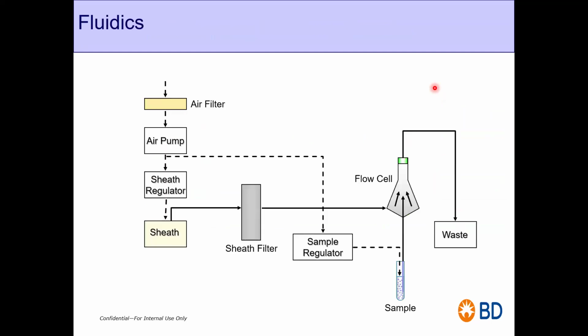So let's talk about the fluidics. This is just a basic overview of fluidics. Let's just open the machine. I can't do that, but I'm making you imagine it. When you open the machine, you'll find something like this. As you have the Lyric, tomorrow I'm going to show you that as well. But just for your information, keep this in your mind, as it will be very helpful when I explain more things about the machine.